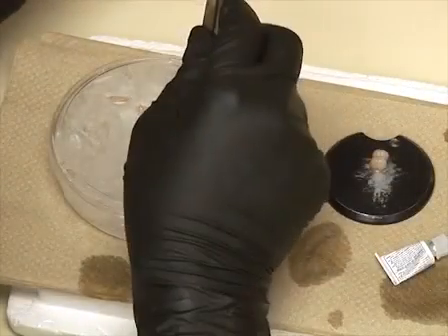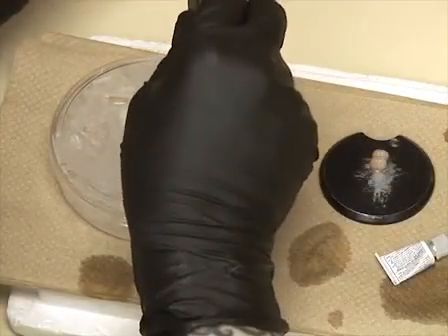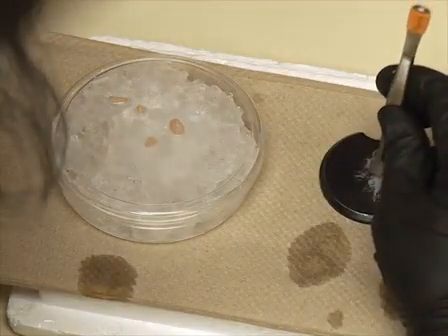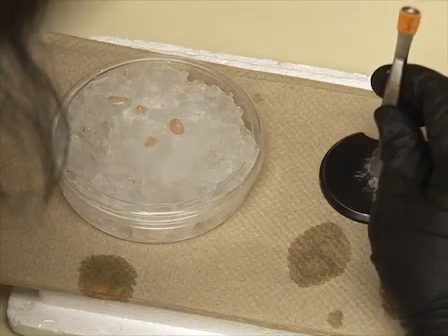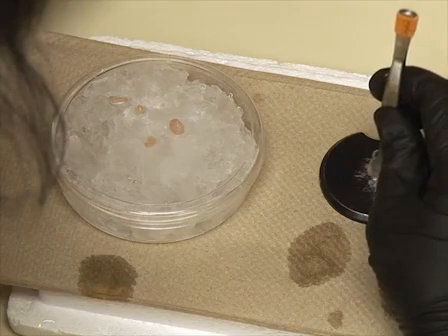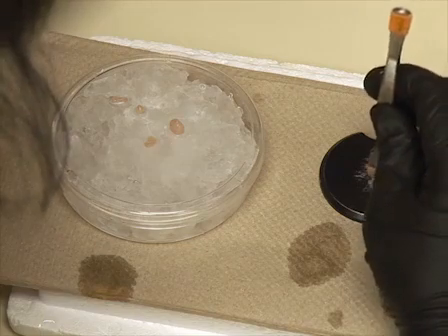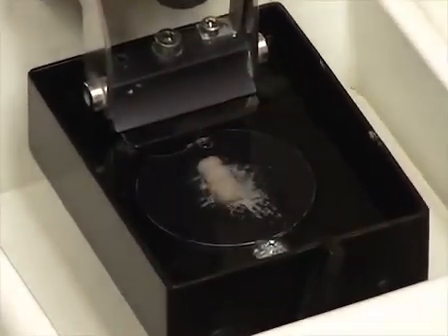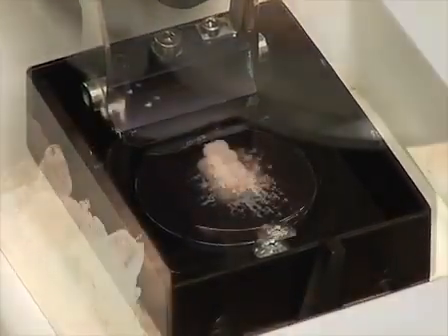For the last brain, it is prudent to position the dorsal side away from you, as cutting is sometimes incomplete in this direction. If incomplete cutting should occur, use a scalpel to slice through and collect the section. Speed is of the essence for the gluing step, as the brains can't be exposed to air for too long. Once all brains are glued in, the chuck is placed in the vibratome and the holder filled with ice-cold ACSF.